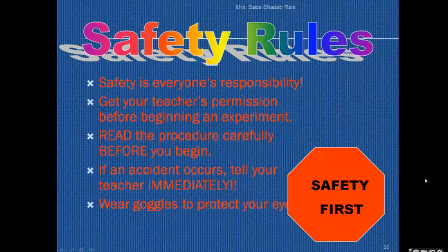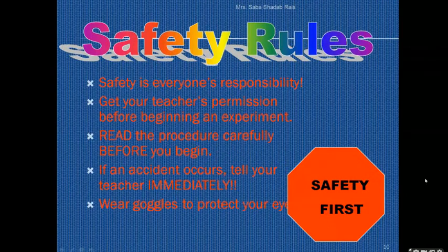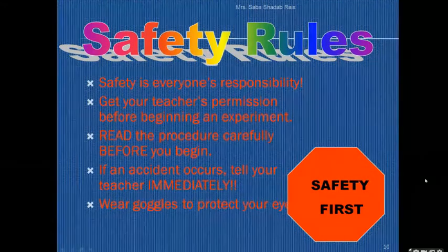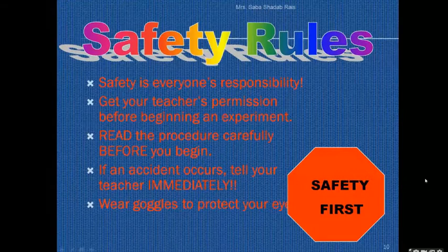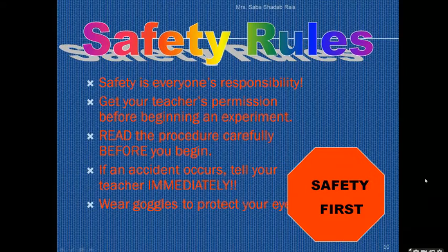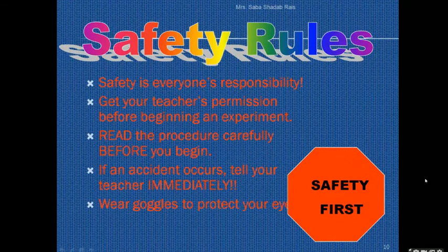Then before startup, you have to read the procedure carefully. Most of the time students come late, and when you come practically into the college, you will find that I don't allow any latecomer. Students feel offended that all the other teachers are allowing, then why don't I? The reason is, if you have not heard the procedure, you can hurt yourself, and it is for your safety. If you don't know the procedure, you should not perform the practical, because you can harm yourself. So make sure that you always reach the laboratory on time.